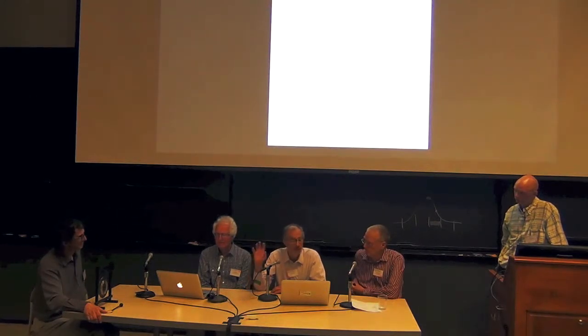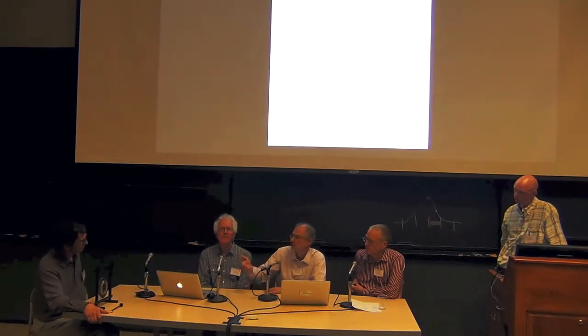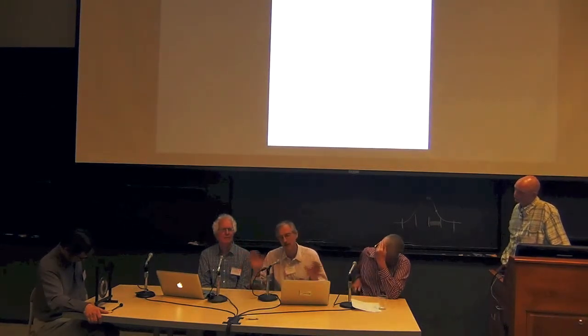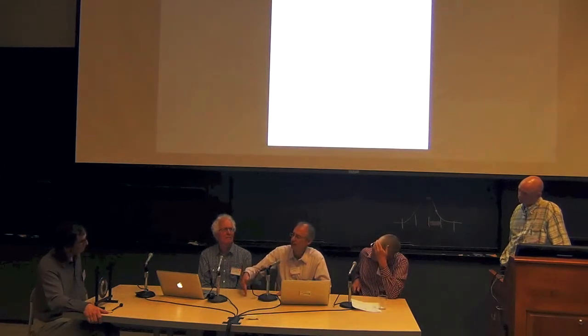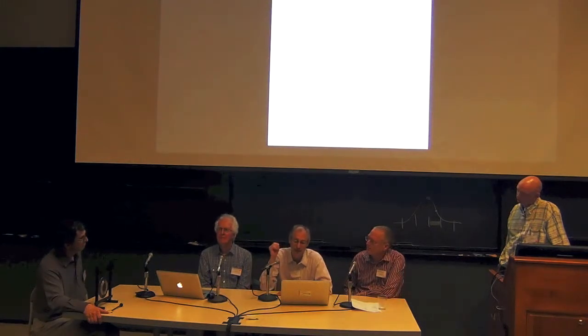There were some clues there. If they hadn't told you that it was 1 degree per image, you wouldn't have a reason to try to figure out why information was missing. Certainly it's geometric, but even at the high resolution shell, I think you should have better than 95% completeness. It's possible to say I solved the structure to 1.5 Angstrom resolution using 50% completeness in the outer shell. There's nothing wrong with that, but I wouldn't put in my title that it was a 1.5 Angstrom structure unless my completeness was higher. So there are some clues in the table 1.